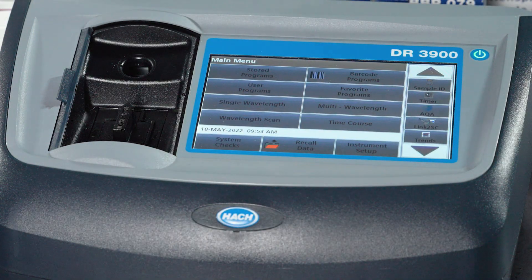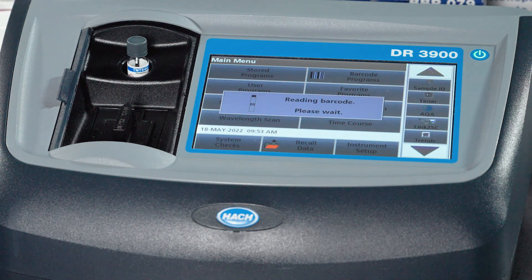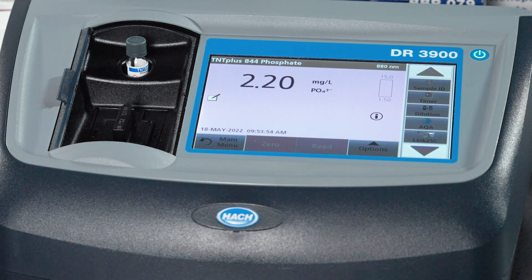The nice thing about the TNT Plus is you just drop it in and it's going to read the barcode and pull up the correct method and we get the result.